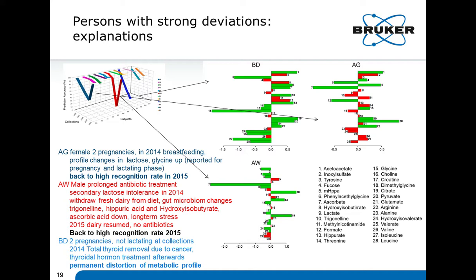and this showed up in a permanent distortion of the metabolic profile. So here it hasn't been re-established. And you see the metabolites which are actually changing during this action. So here you see a very clear tool for how you can actually follow up the treatment.